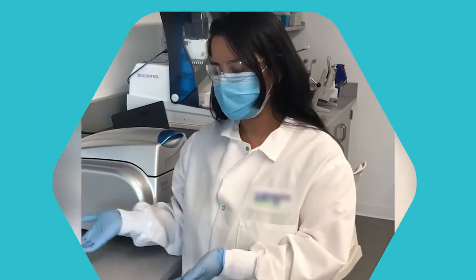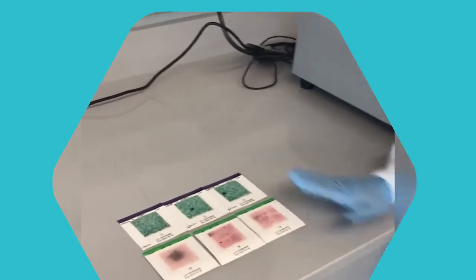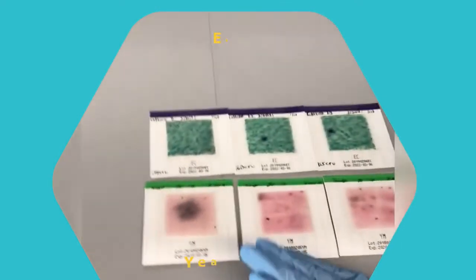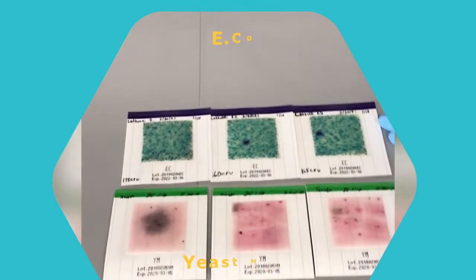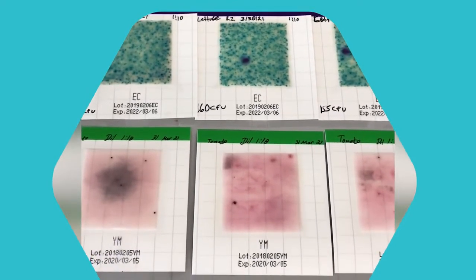Hello everyone. Again, this is Shekeba. I just wanted to bring your attention to our results. So right here, we have the tomato that we inoculated in the yeast and mold MC media pads. And then we also did something parallel for E. coli for the lettuce.